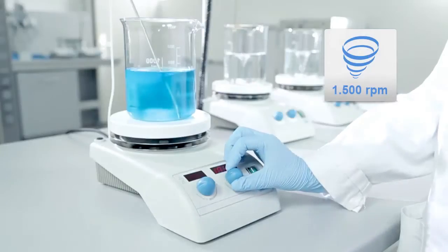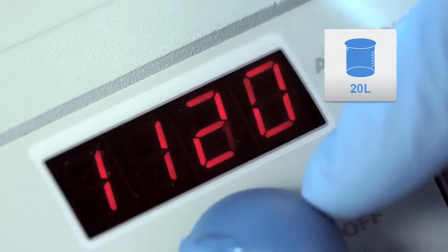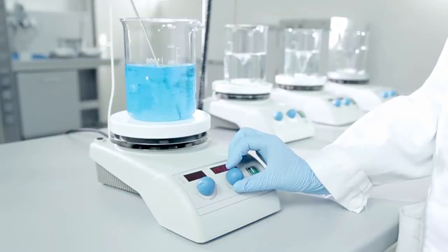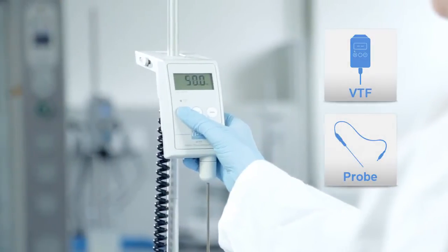Advanced technology, excellent temperature homogeneity and fast heating bring this stirrer up to the highest level. Speed Servo automatically ensures exact speed under changing load. Premium performance can be achieved with a VTF Digital Thermoregulator for direct control of the liquid temperature.